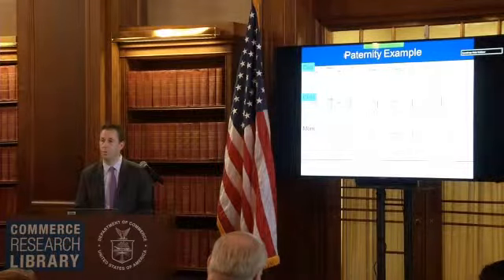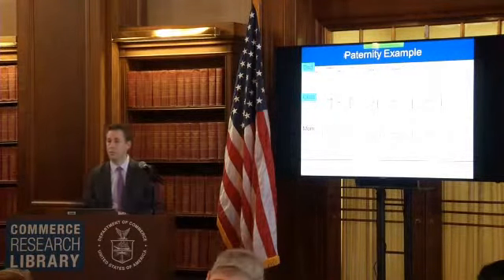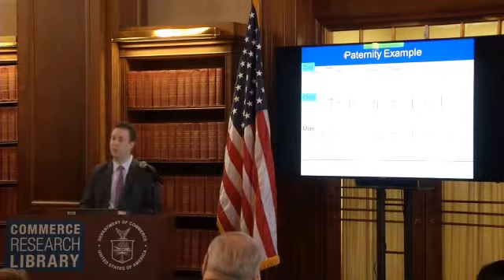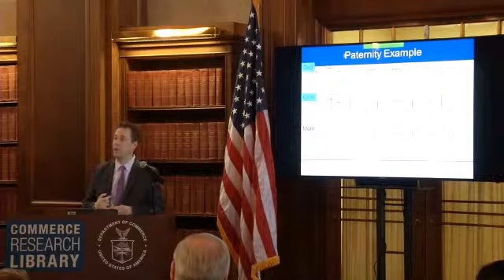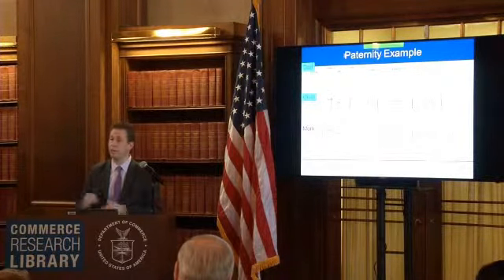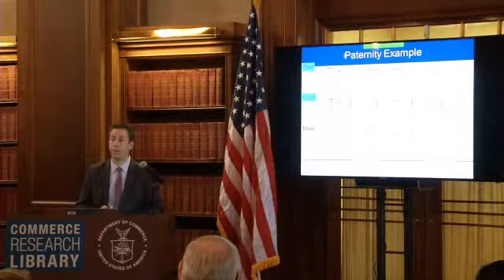So that's a graph of the mom, child, and dad. If the dad was an identical twin, how could you tell which one is the father? I would say you wouldn't be able to unless you have a lot of money to do more genome sequencing. It wouldn't be done under the normal guise of human identity testing. It would have to go through high throughput sequencing. You'd have to look at more of the genome to try and find differences between the twins and then try to associate those with the child. So it wouldn't work well.